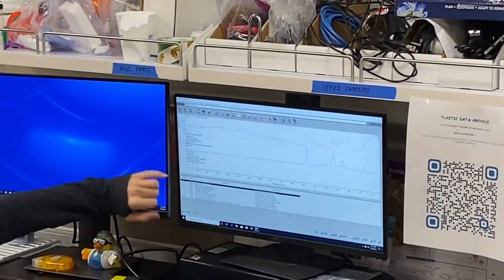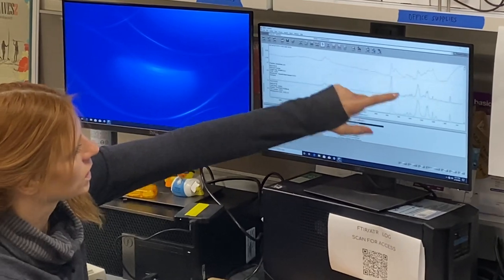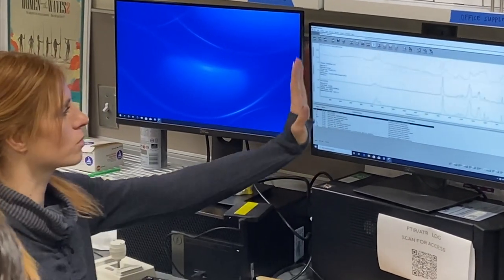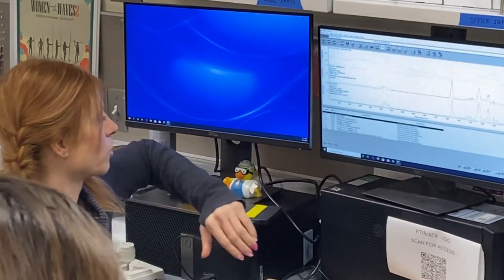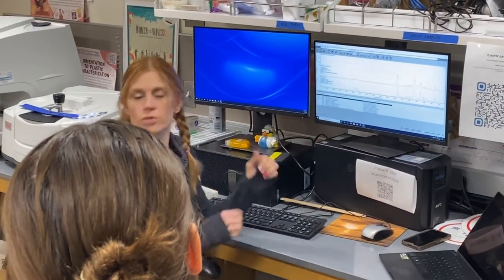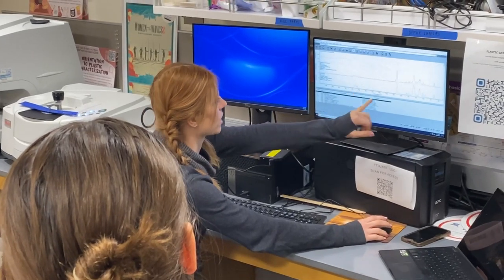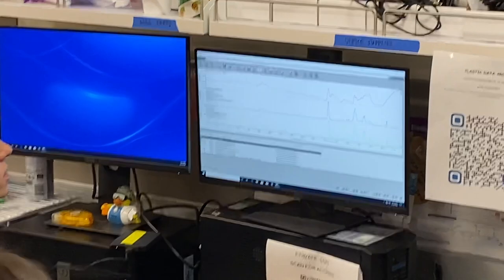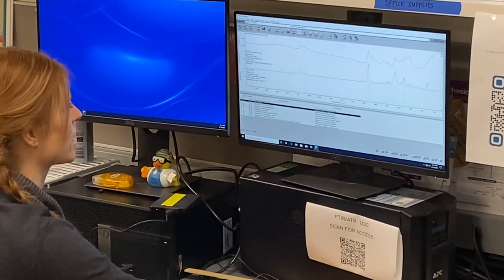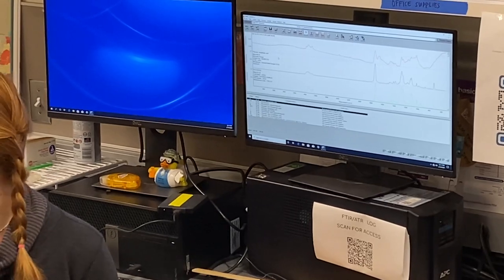Everything else says it's polyester. What it's doing here is this is our spectrum that it ran on our sample, and it's saying this other spectrum we have that is polyester — look at that peak right there, it's matching. Look at that peak, it's matching that. Over here it's matching those peaks, and it's saying those peaks are occurring at the same absorbance level, at that same wave number. So it's saying that's the percentage — 68% — of how close it is to our spectrum. And then it's saying this other polyester spectrum, which is a little different, matches at 67%. You can scroll down and do your own kind of matching, but it kind of does all the work for you. Does anyone have any questions on how that works?